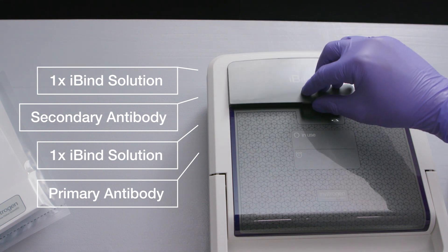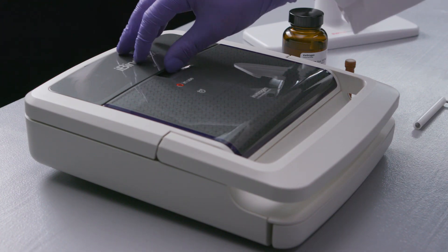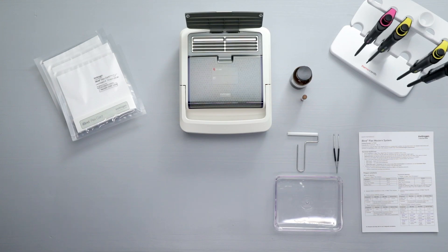Close the lid and use a dry erase marker to indicate that the device is in use, and note the start time of the experiment. The blots can be removed after 2 and a half hours, or can be left overnight. When you return, open the liquid door to ensure that all the liquid has moved into the card. Any remaining liquid indicates that the experiment has not yet completed.